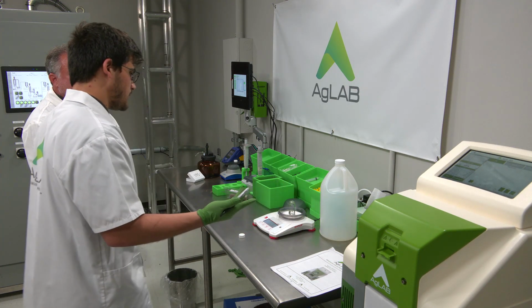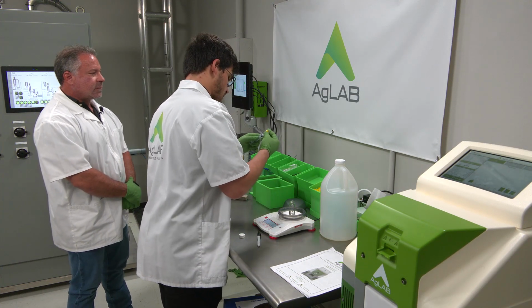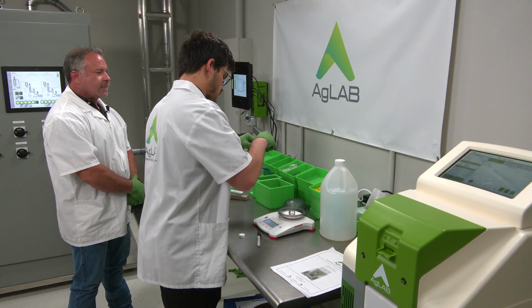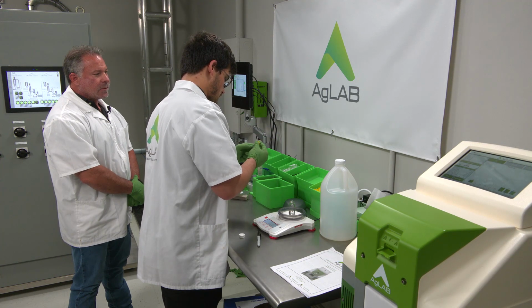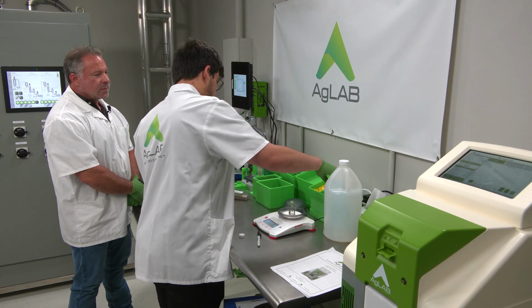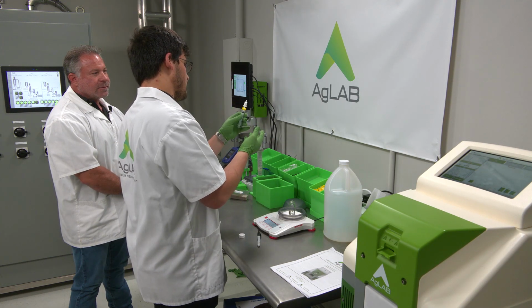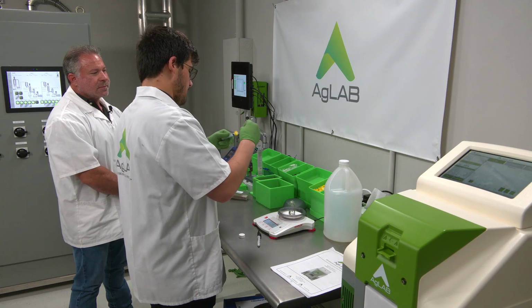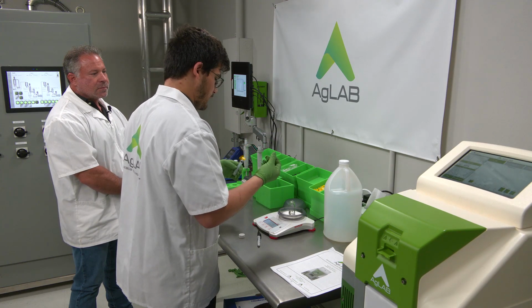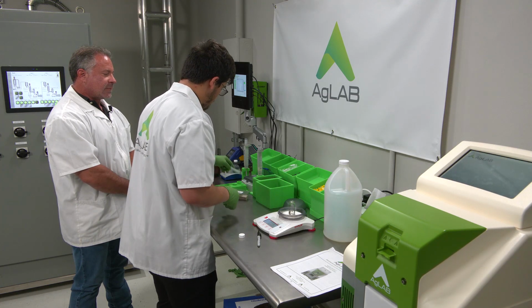For head samples, I like to think of it as you need to put the... I should probably swap my gloves out here. The way I remember this is you have to put the head on to the head samples, so it needs the nylon filter, and then you attach its head here, which is a quick catcher. Tail samples, it's just going to be our nylon filter only, and just make sure it's not contaminated.